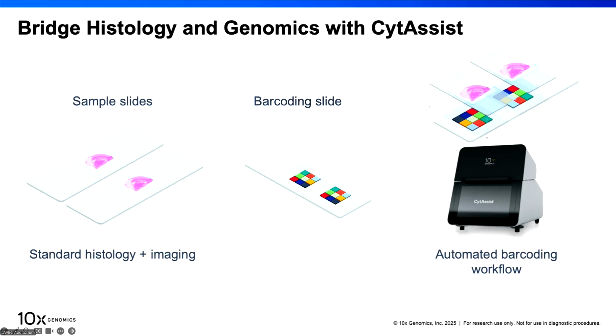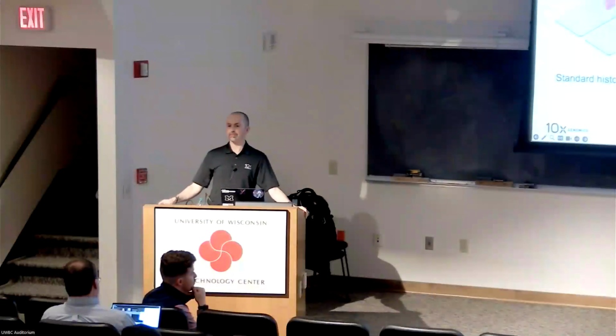But again, generally speaking, when it comes to sample prep and sample QC, that also depends on the sample type. I would recommend having a conversation with us. We can bring in the field application scientist, and that is where we can have an in-depth discussion on how to QC your samples and how to prep your samples, depending on needs and sample type.